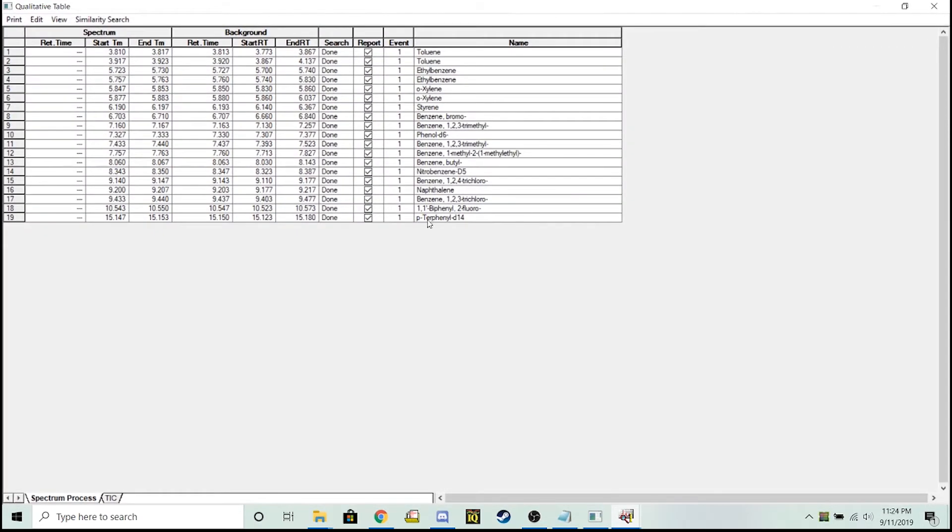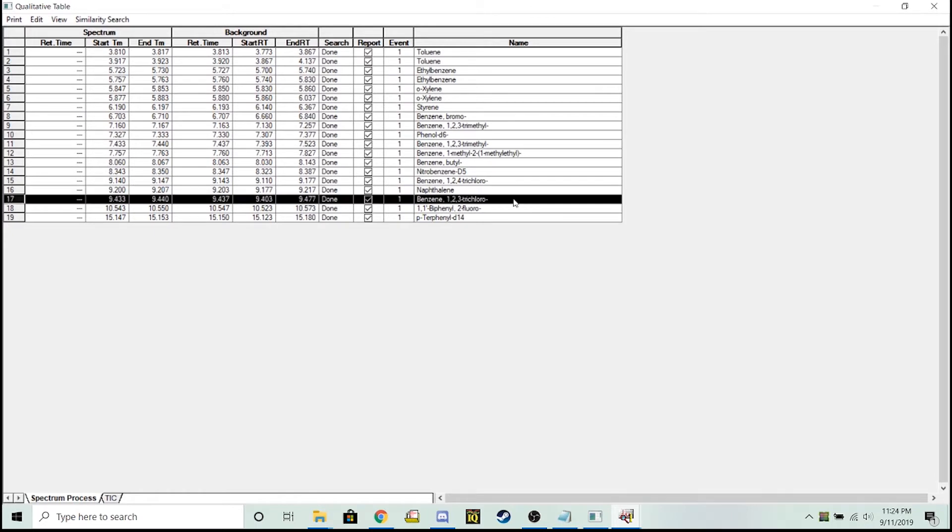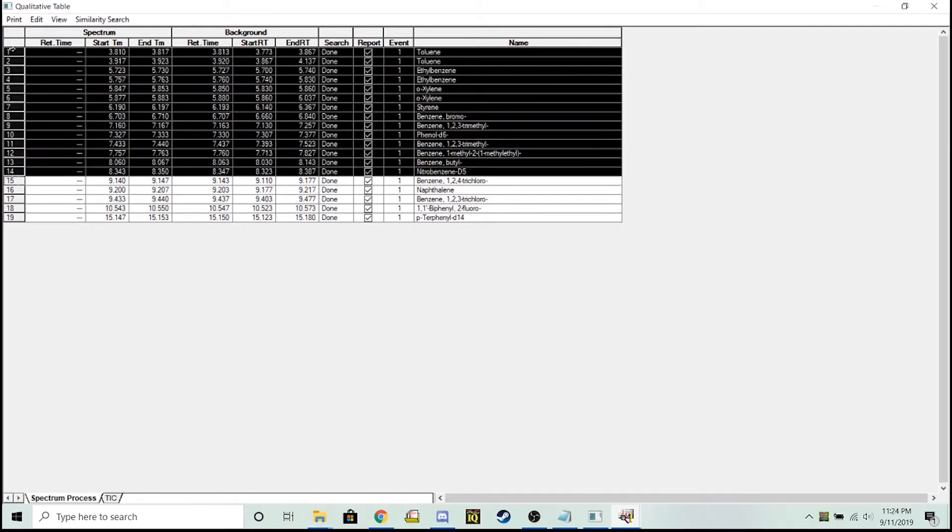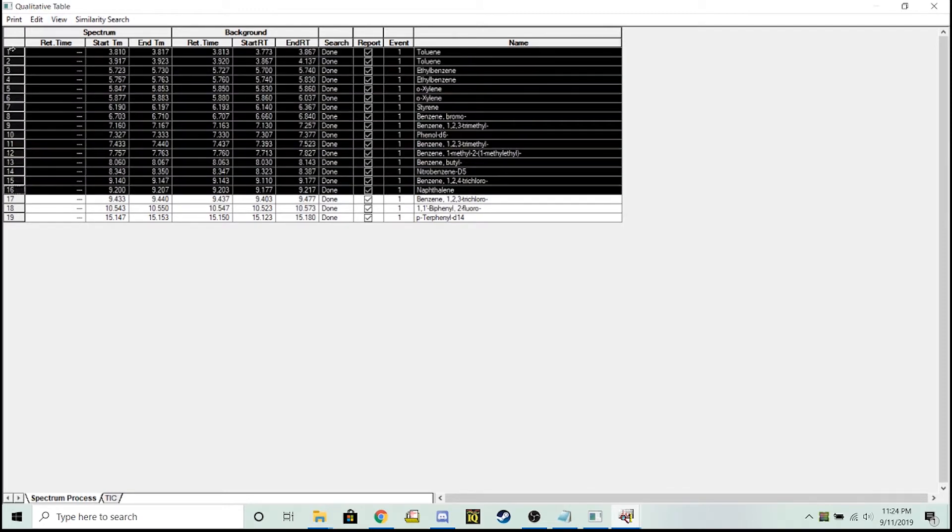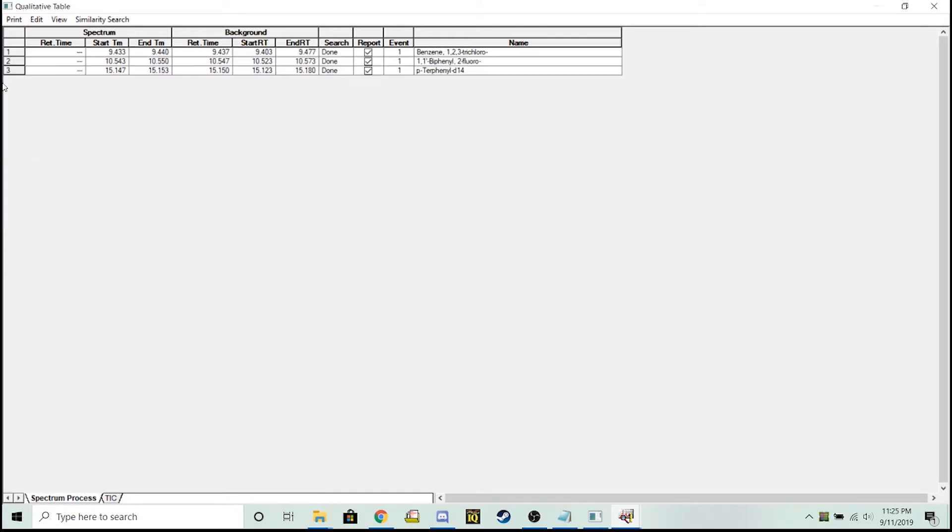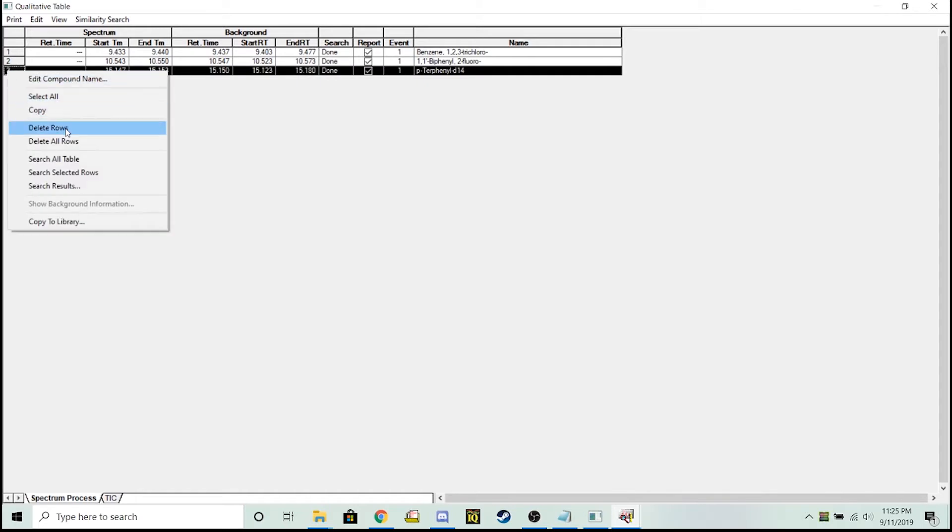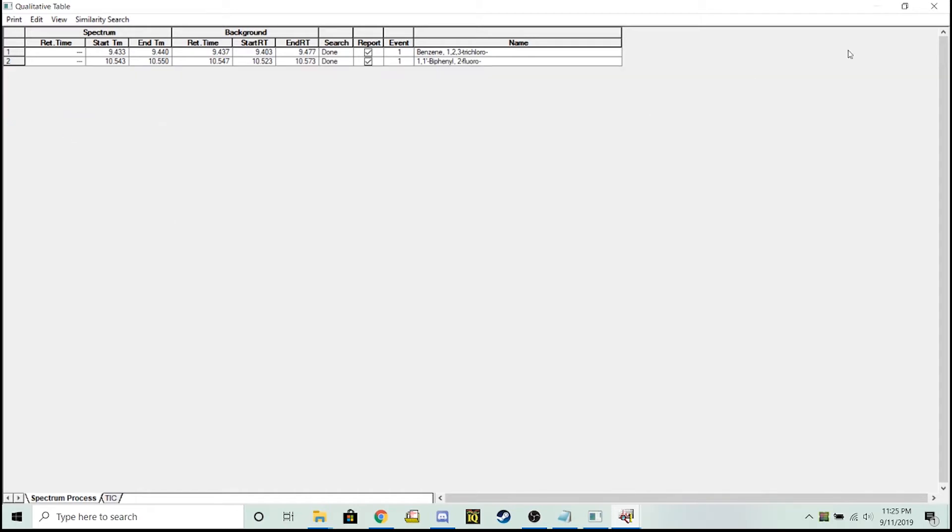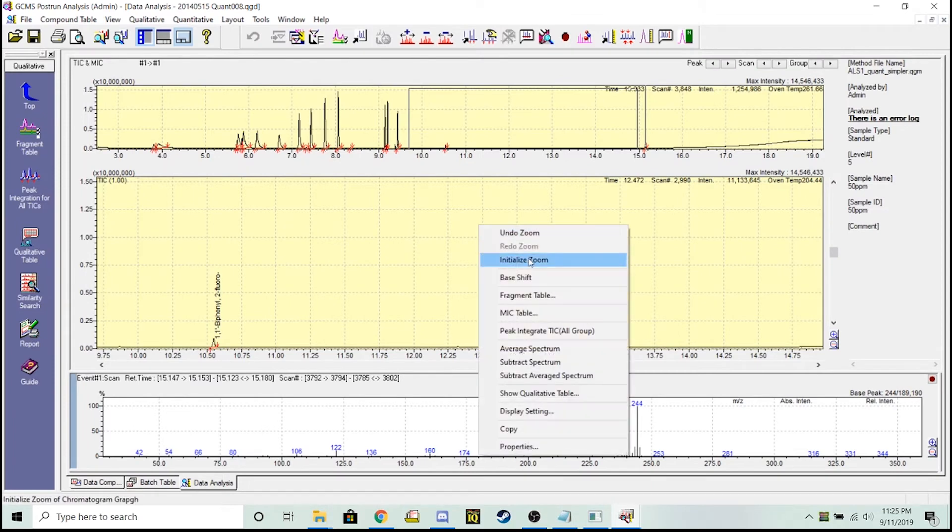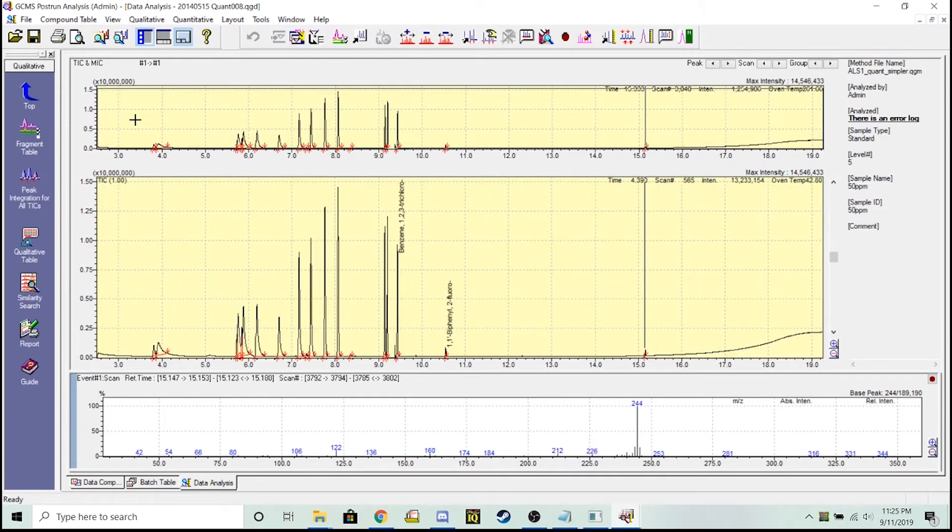Now when I go to my qualitative table, I've got a listing of all the different things in this data file. I only care about my trichloro target and one standard, my two fluorobiphenyl. I'm going to delete everything that I'm not trying to calculate. Looks good, only got the two things I care about here. I'm going to click this save tab.